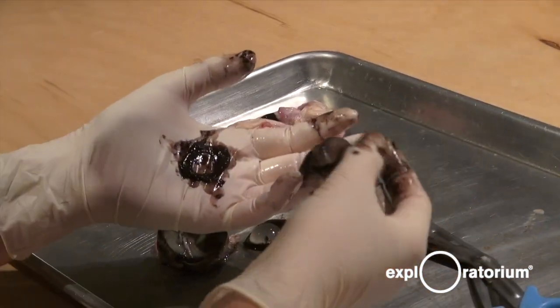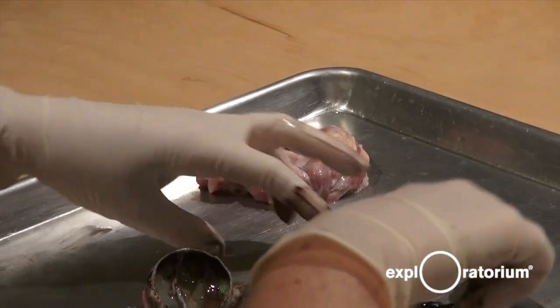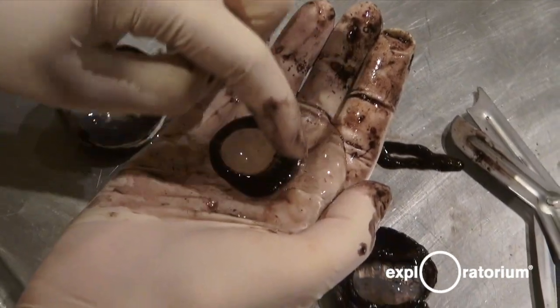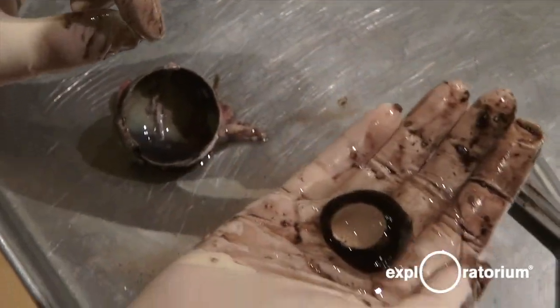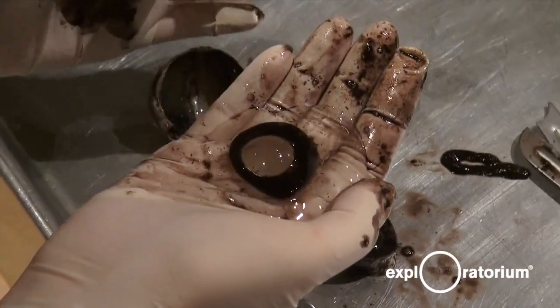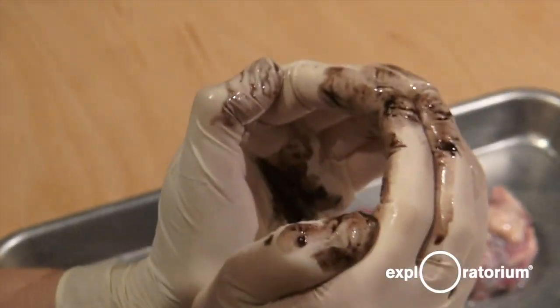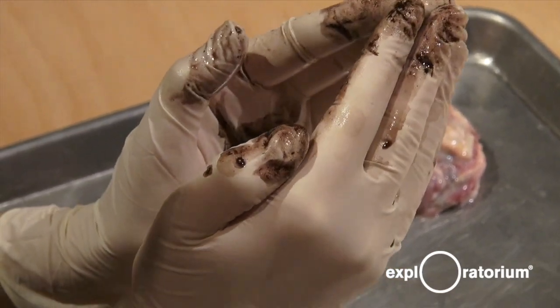Light will go through the cornea, get nice and focused, go through the pupil, and then it will hit this right here — this is called the vitreous body, and it's made up of three parts. The lens is on the top, this is the ciliary muscle, and this is the vitreous humor. The lens is the other magnifying glass in our eye. Our cornea does most of the focusing, about 70 to 80%, while the lens finishes the job and does that other 20 to 30%. Your lens can change shape depending on what distance you're looking at — if you're looking at something close up, that muscle will squeeze the lens into a fatter, rounder shape.